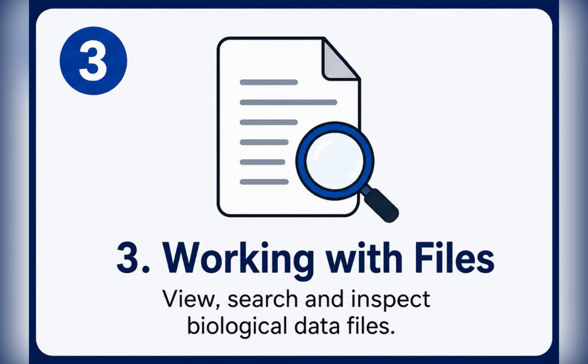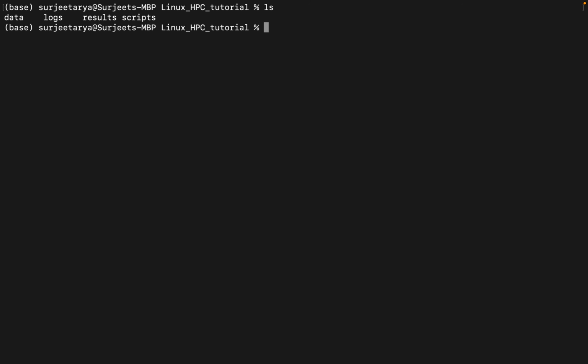Now that we know how to create and manage files, let's learn how to view, search, and inspect them. These commands are used constantly in bioinformatics because most analyses begin by checking input files. First, I move into the data folder where my sequence files are stored. Running ls shows all the files available in this directory.